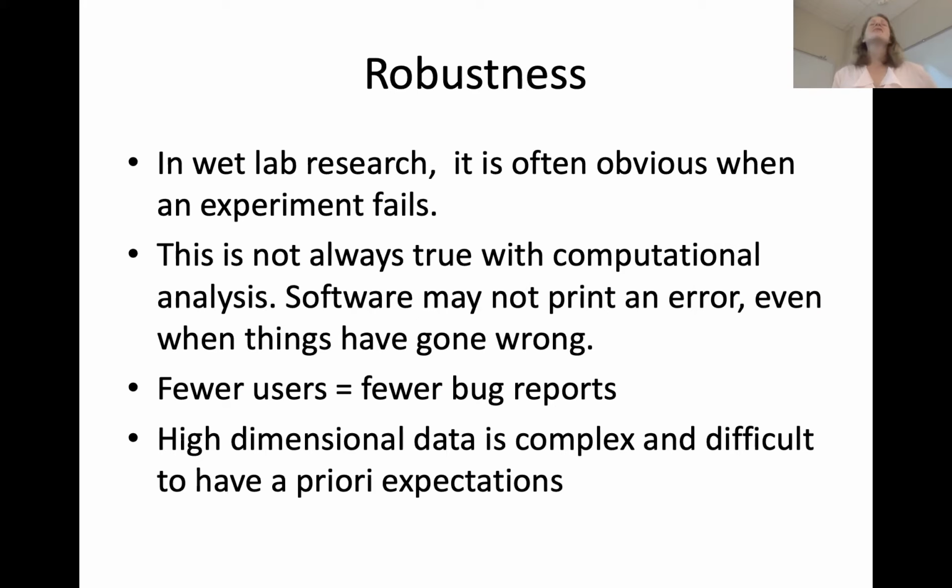And I like to talk about this a little bit with every class because I see a lot of biologists coming from the bench side who just believe whatever a computer tells them. And that's a very dangerous way to live your life because a short read mapper program, for example, might map your reads and say, hey, here you go, here's your BAM file. And if you never really look at whether it did a good job, you could have a huge problem.